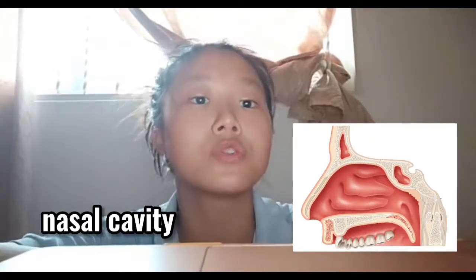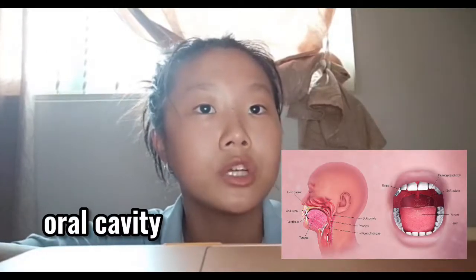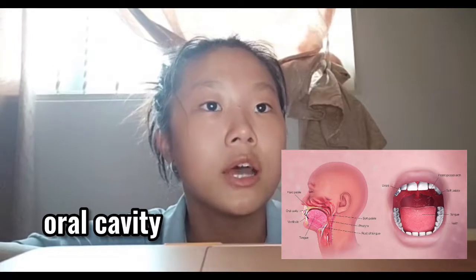Here are the parts that we won't include in the dissection. Nasal cavity keeps your nose moist by making mucus so you won't get nosebleed from dry nose. Larynx serves to protect the lower airways, facilitate respiration, and is the key role for phonation. Oral cavity serves as a secondary respiratory conduit, a site of sound modification for the production of speech and chemosensory organs.